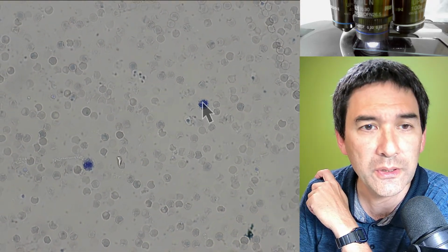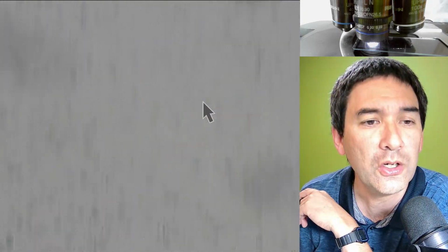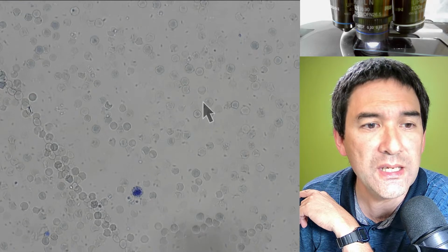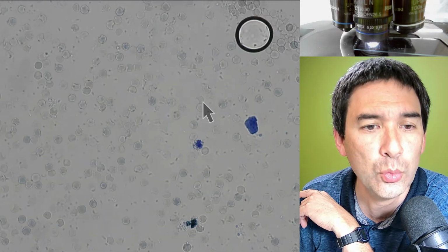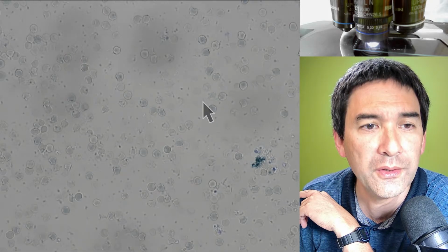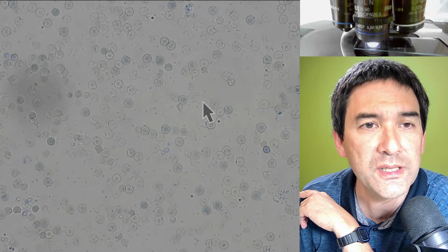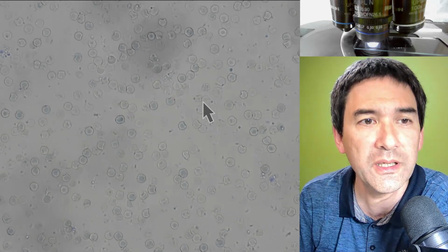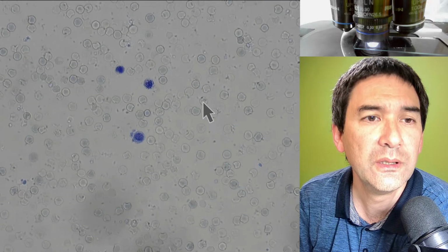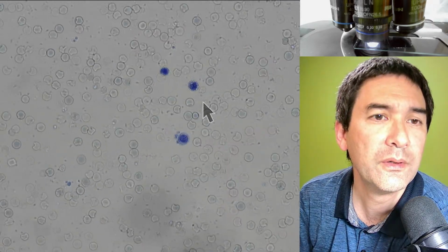Okay, and these are white blood cells, but these are not the ones I wanted to show you, because some white blood cells have a very interesting shape concerning the nucleus. This one maybe is also not a very typical one. You also see right now that many of the red blood cells are not quite as visible anymore. Many of them probably popped open already and have lost their contents. So here are again 3 of them.